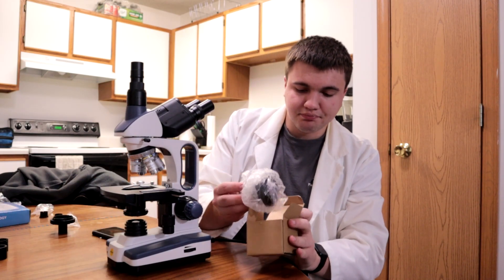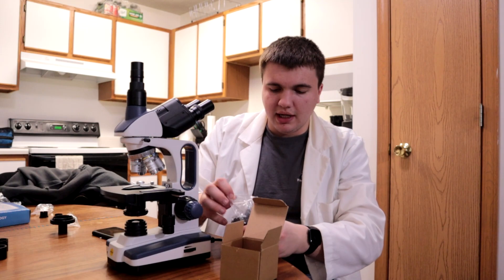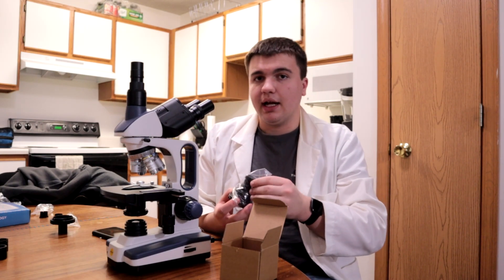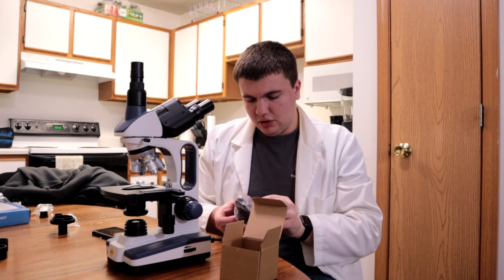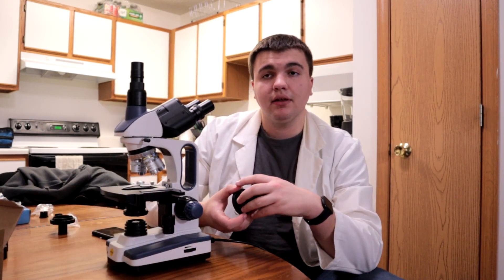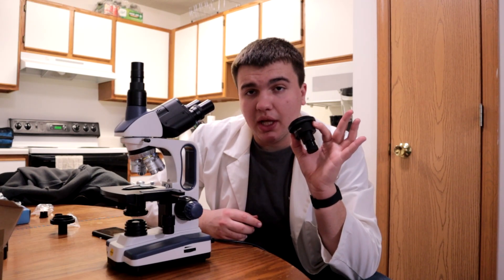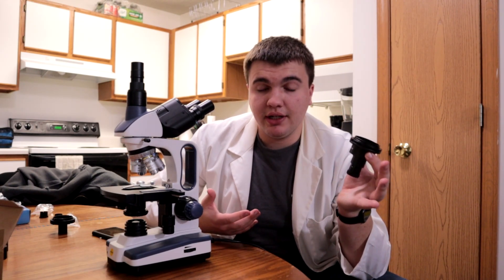Inside the little box here, more bubble wrap. It comes in a plastic bag like this. The reason I took interest in this is because it has a lens. I learned about something called a field flattener — this is for telescopes — but I figured maybe the same thing can apply for a microscope. Basically, on certain telescopes, the image can't fill the entire frame of a full-frame sensor. This is a crop sensor camera, but still, it probably wouldn't fill the full frame, and then there's fringing on the edges.